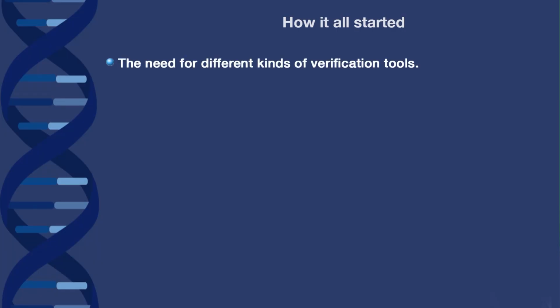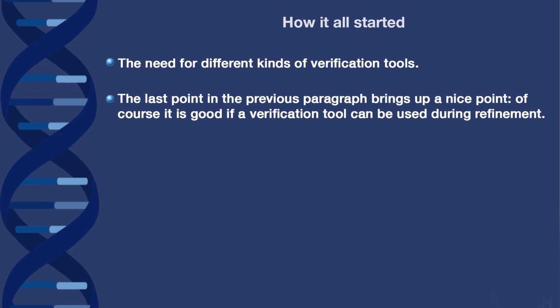So, the need for different kinds of verification tools was the hour of need. Hence, a good refinement tool and verification tool is an important aspect, and this is where WHAT IF and SAVES came into the picture. So, this verification tool can be used for refinement purposes.